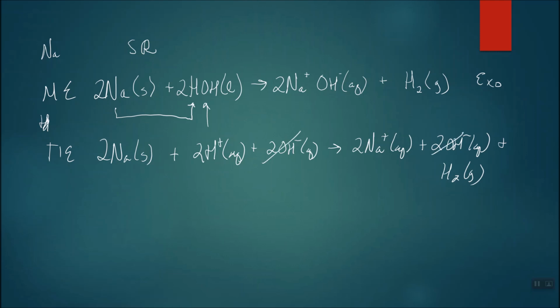It is. Now, you did see the presence of hydroxide. When the solution turned pink, that was telling you that hydroxide was being created, because of that chemical that I added, phenolphthalein, and when we talk about acids and bases, we will bring that back up. That chemical that I added tells you of the presence of hydroxide. So it turned pink because of these hydroxides that are being created when sodium is tearing apart the water molecule.